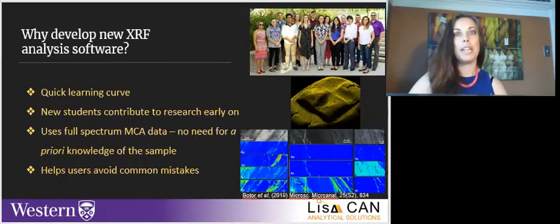The software is commonly complicated and leaves too much of the detailed handling and combing of spectral data to the human eye. Data analysis is delayed and often not fully interpreted. This also makes it extremely difficult for a non-expert.